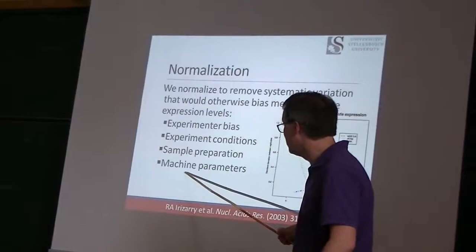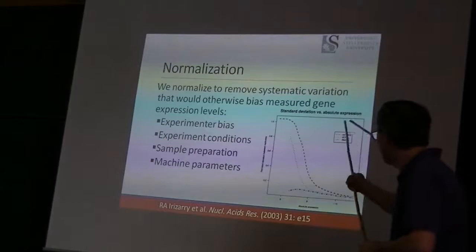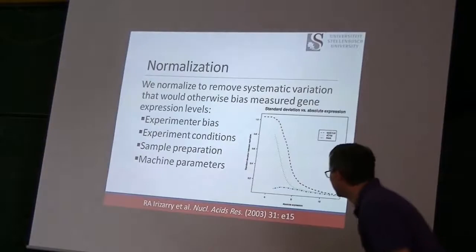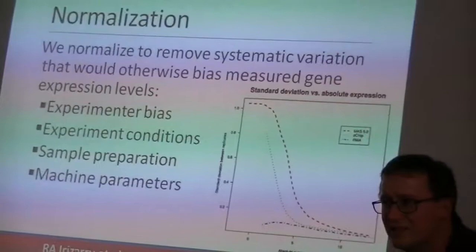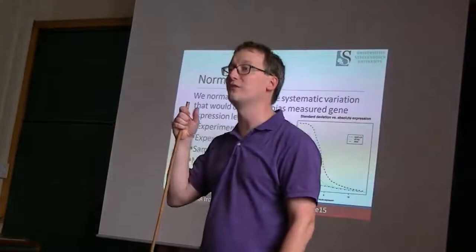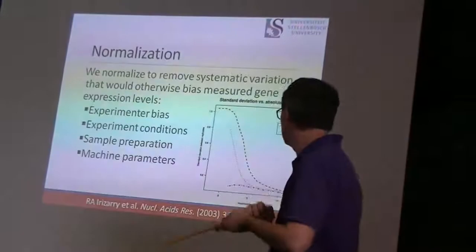We see that there have been a variety of methods out there that are published. I know we kind of get biased to think we want the highest score on arbitrary scoring techniques, but I'm going to read this label for you. It says, standard deviation between replicates. Would you want a high or a low standard deviation between replicates? Low. We want it to be very low. We want to have a low coefficient of variation among these.